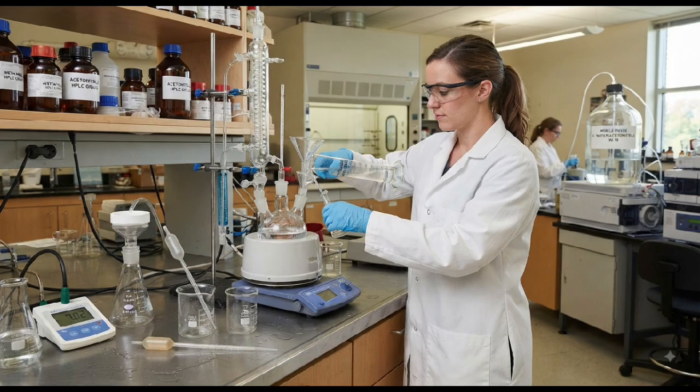Mobile phase preparation. The first step is preparation of the mobile phase according to the approved analytical method. The mobile phase may contain water, buffer, methanol, acetonitrile, or other suitable solvents in a specified proportion.